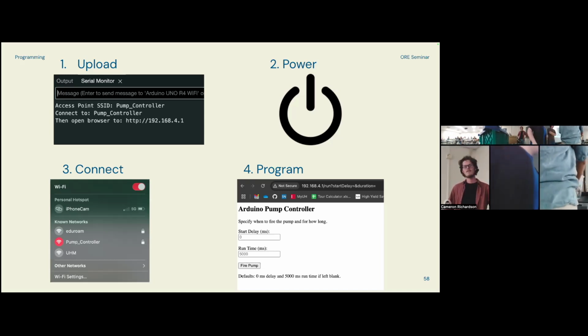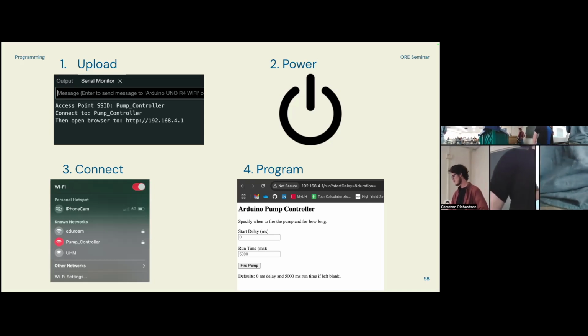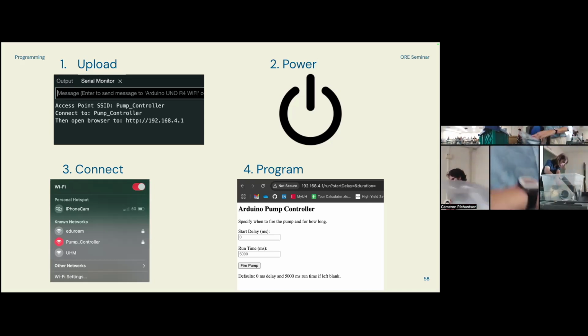Do you want to do it straight into the beaker, the second sample? Yeah. Okay. I'm going to show you that it's actually 1 liter, straight into the beaker.